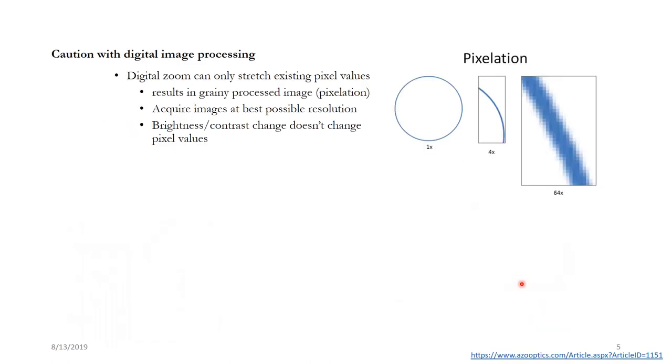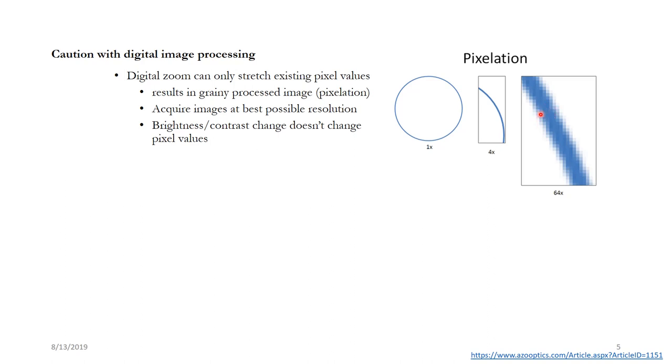Now image processing is great but there could be some caveats as well. For example digital image zoom can only stretch the existing pixels. So here you can see that this was the original image. If you keep zooming in you are not producing any new information. Which means is that if you want a high resolution image of tiny particles here, make sure that you have acquired image at a higher resolution. If you have acquired a lower resolution it is not going to give you any new information.